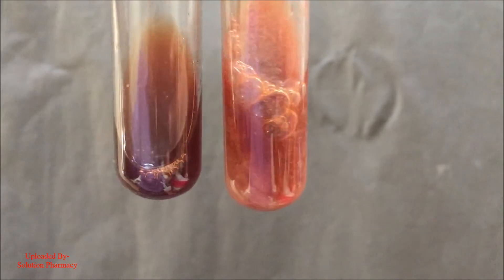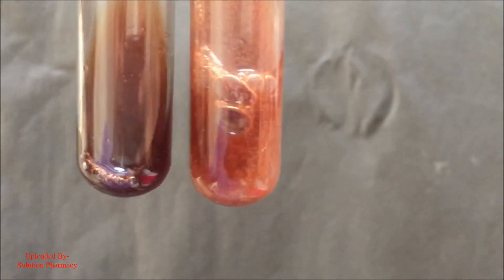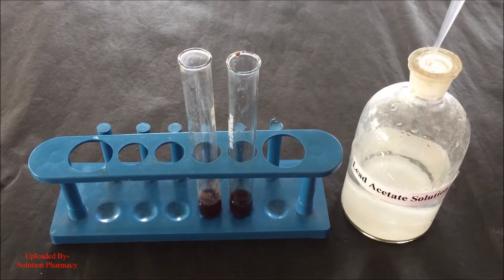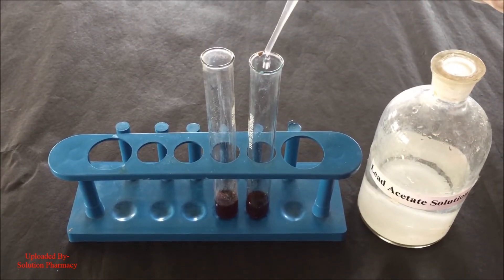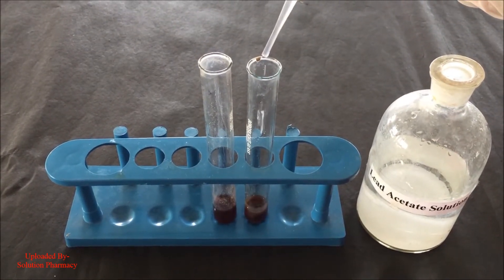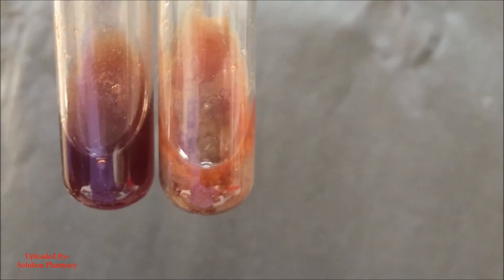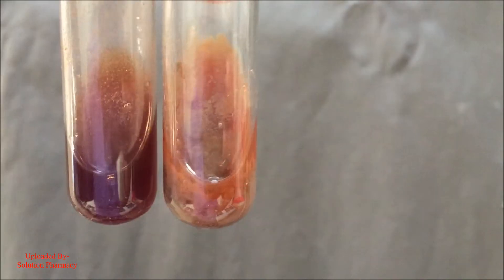Now we are going to perform the third test, that is the lead acetate test. Take 2 ml of the aqueous extract in both test tubes and then add few drops of 10% lead acetate solution to one test tube and compare the changes with the second test tube. Formation of white precipitate indicates the presence of tannin in the extract.